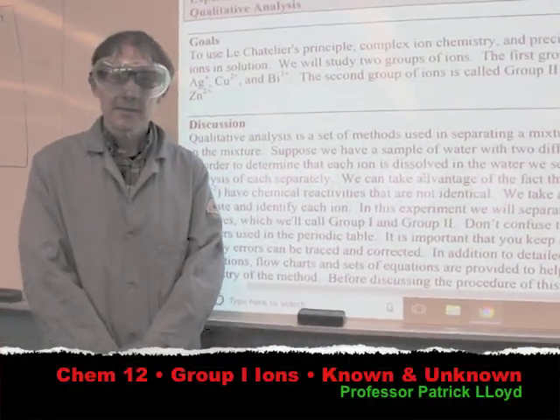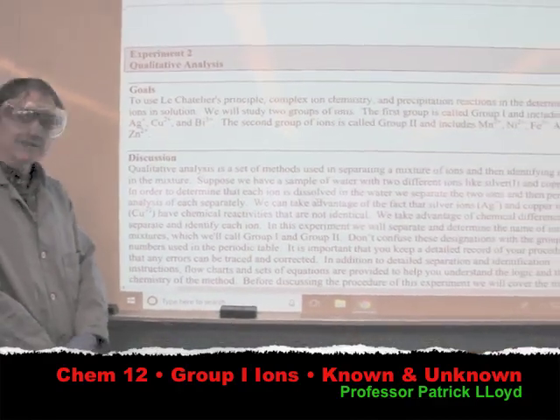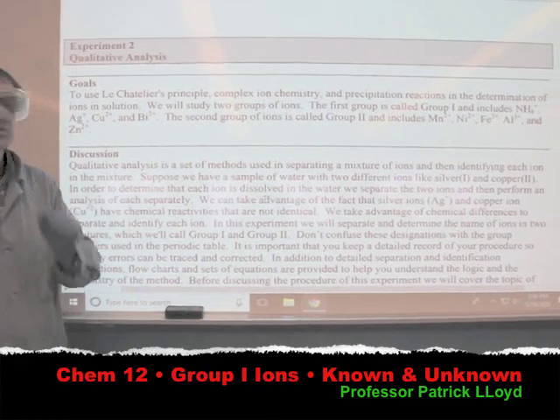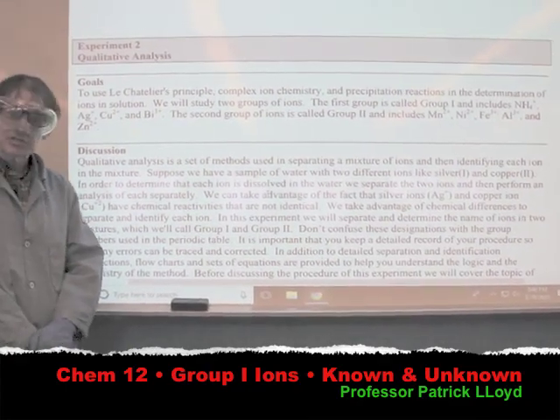Welcome. I'm Professor Lloyd, and I'm going to talk to you today about the qualitative analysis experiment. This is going to be qualitative analysis part 1 and part 2, the group 1 ions.